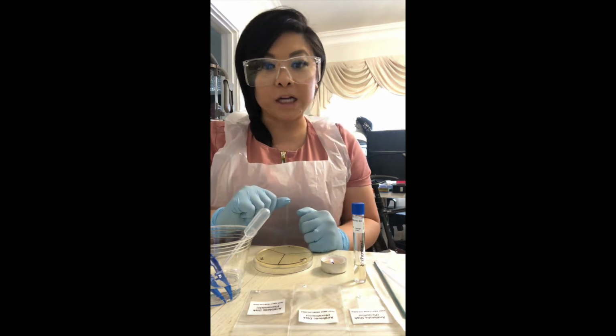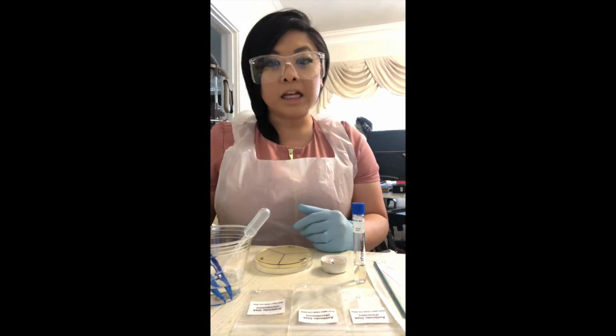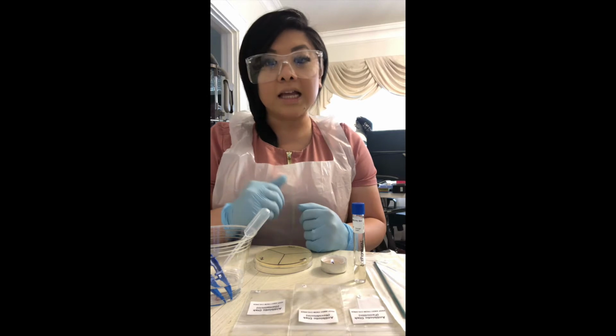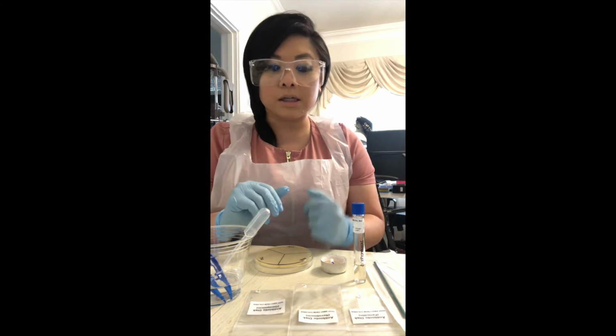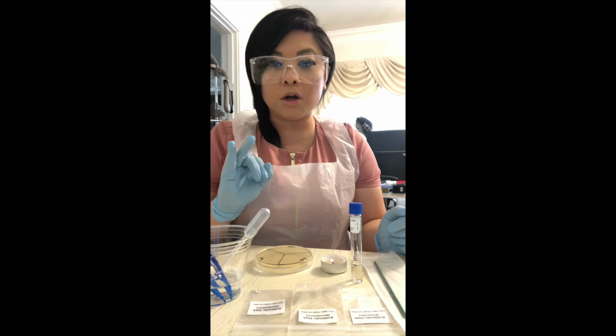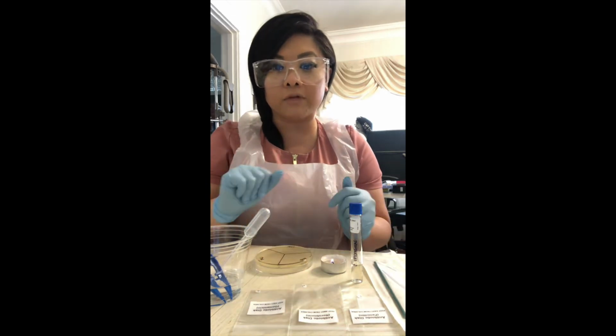This video is for Bio 225, Week 7. Today is June 24th, 2020, and the experiment today is called Antibiotic Sensitivity Kirby Bauer Diffusion Test. In this experiment, I will be performing a Kirby Bauer diffusion test with Staphylococcus epidermidis and 3 antibiotics, penicillin, novobiocin, and gentamicin, which I already have over here.